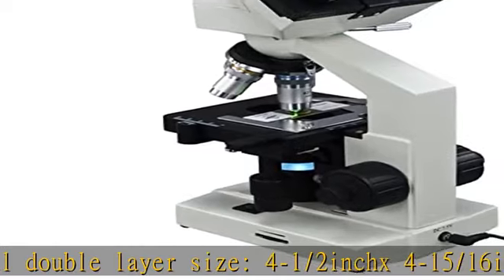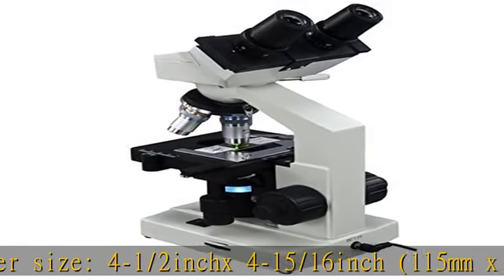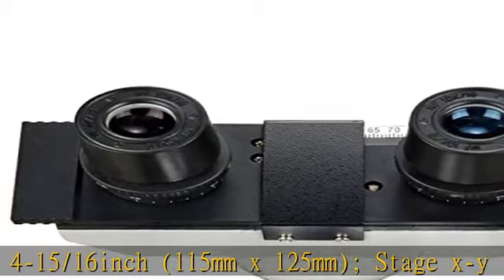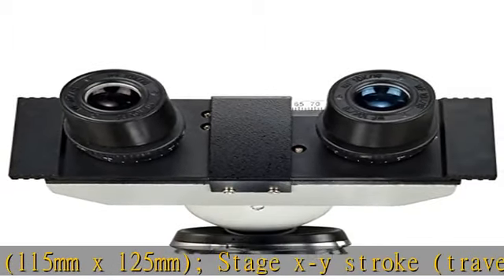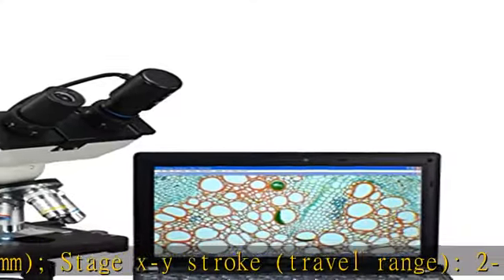Condenser and diaphragm: NA 1.25 Abbe condenser with iris diaphragm transmitted. Lower illuminator: LED light, intensity adjustable.